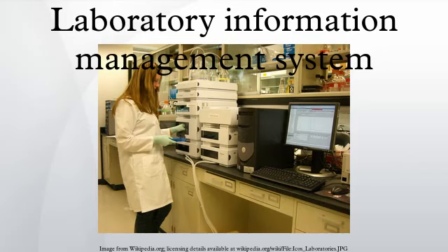A LIMS may need to satisfy good manufacturing practice and meet the reporting and audit needs of the regulatory bodies and research scientists in many different industries. A LIS, however, must satisfy the reporting and auditing needs of health service agencies, for example the Hospital Accreditation Agency, HIPAA in the U.S., or other clinical medical practitioners. A LIMS is most competitive in group-centric settings that often deal with mostly anonymous research-specific laboratory data, whereas a LIS is usually most competitive in patient-centric settings and clinical labs.